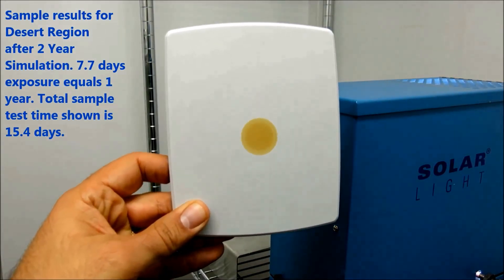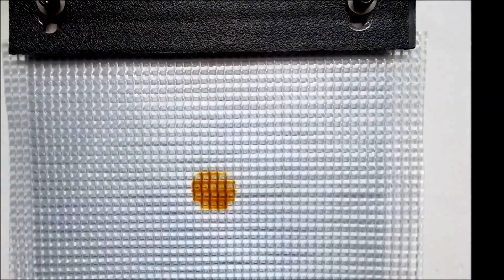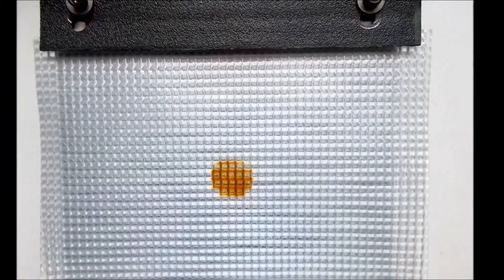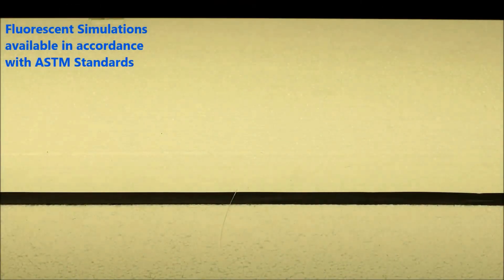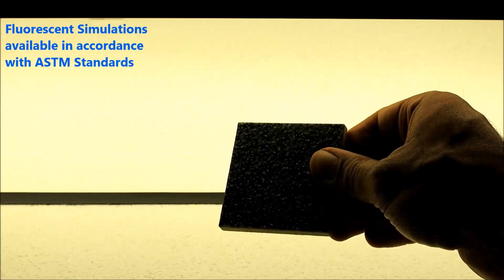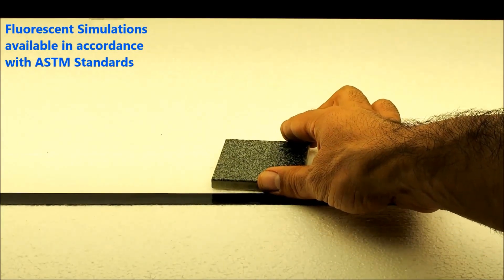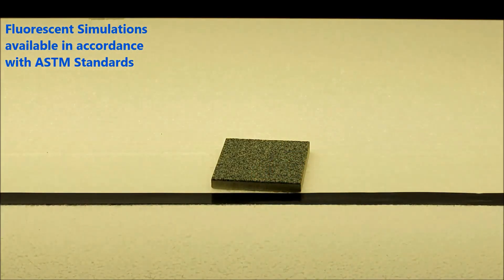Turnaround is very fast. The whole process typically starts within two to five days from receipt of your samples. If your intended interval is only a year or so, we can simulate the exposure from the sun with a fluorescence simulator according to ASTM D4329, subjecting 300 square inches to 1,000 hours per year exposures.